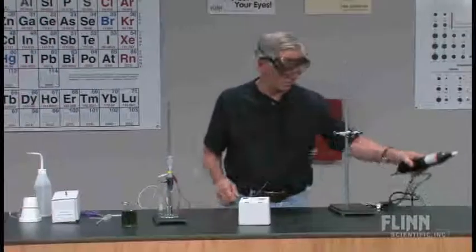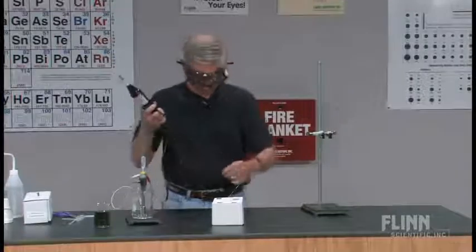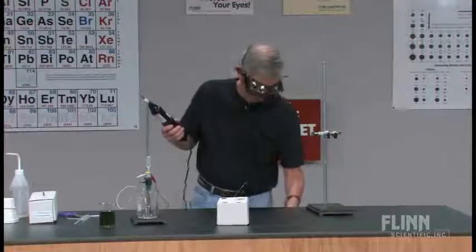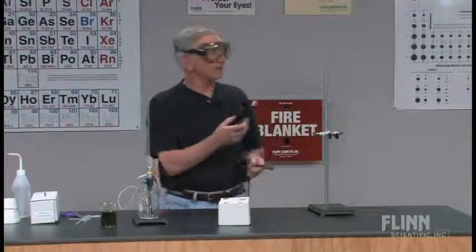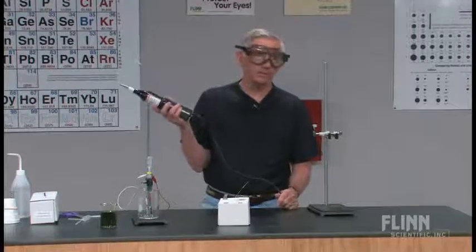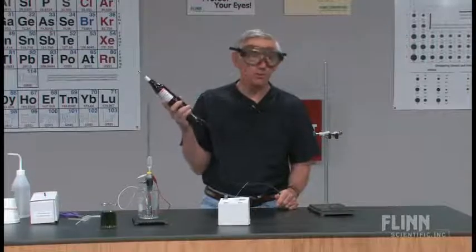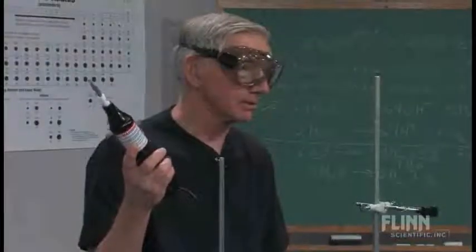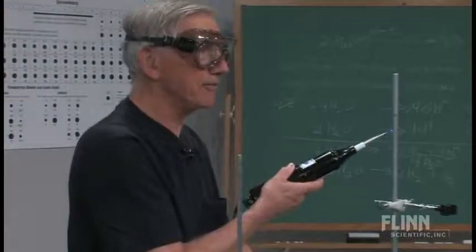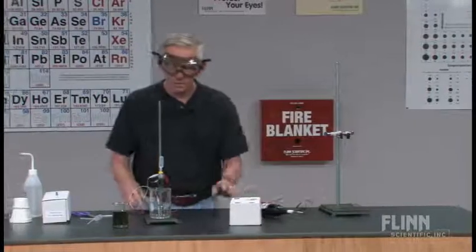I'm going to use a Tesla coil, high voltage coil, not unlike what was in your grandfather's old car. But this is the greatest student motivator. And you almost never have to actually use it. Almost never. This is usually enough. But you see, I'm getting a pretty healthy spark there. So we're going to let this go.